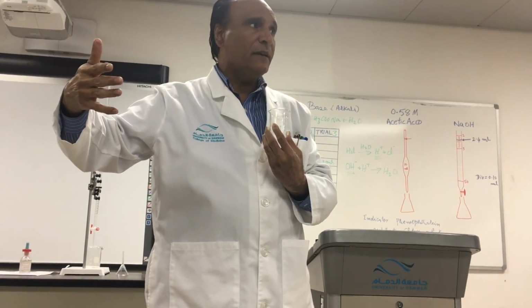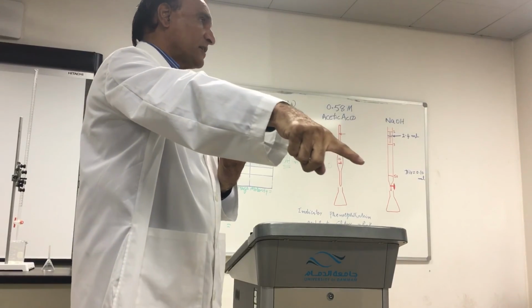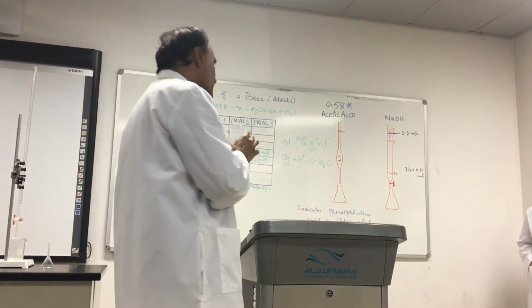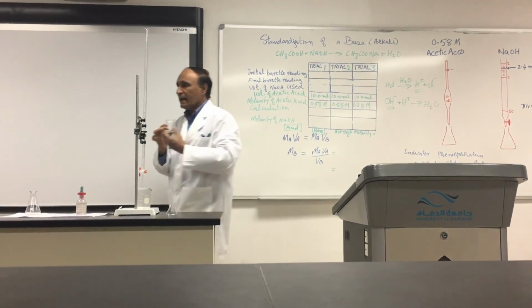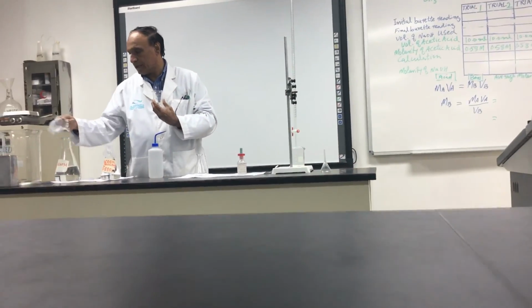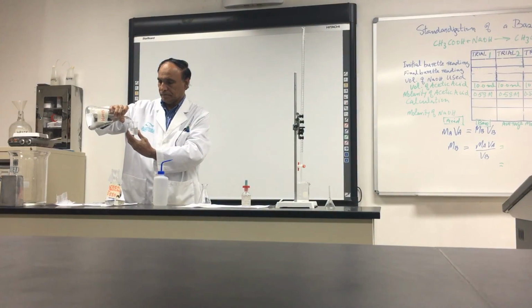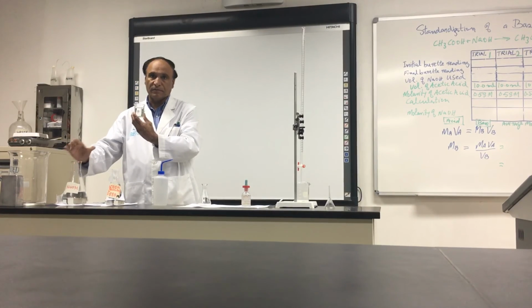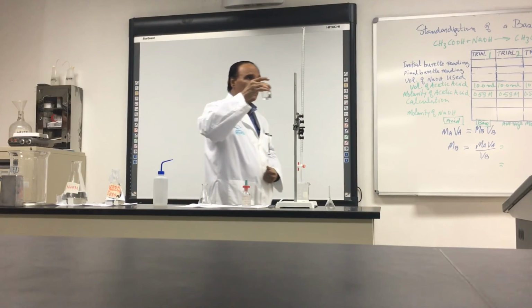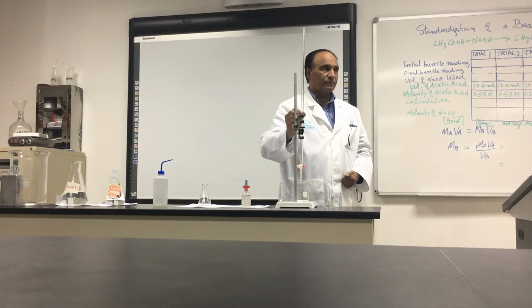When you go home, the things should look like this, so the other group can use that. Did you understand what I'm saying? So it is clean. When you finish the experiment, everything should be like that. So one student will bring the beaker and I will give him sodium hydroxide. This much sodium hydroxide is more than enough. So this student who takes the sodium hydroxide will fill the burette.